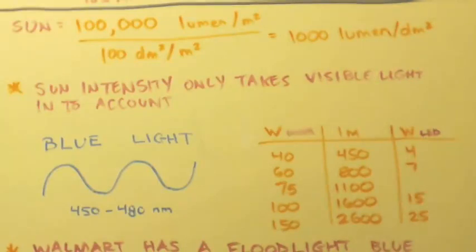But they are counting orange light, red light, yellow light, some of the green light. These wavelengths are not strong enough to break our chlorine-chlorine bonds. They're no good to us. So them including them in the lumens is useless to us. Now, I'm not saying they cancel out, and I didn't do any math about it because I don't care, and you'll understand at the end why. I don't have to be exact.